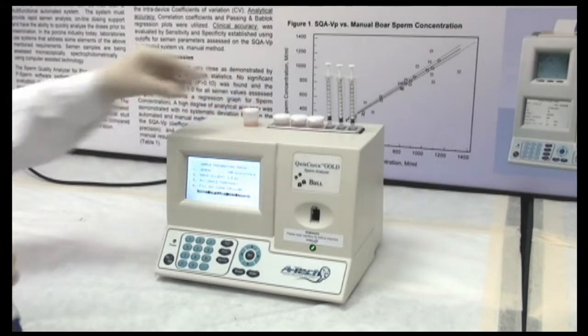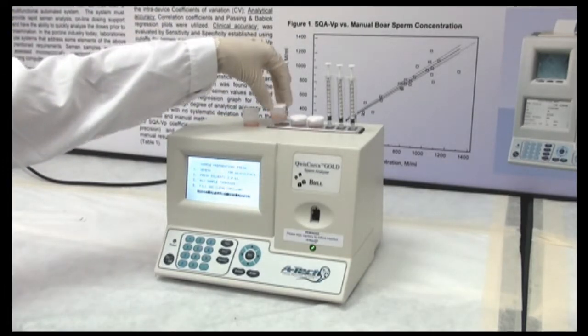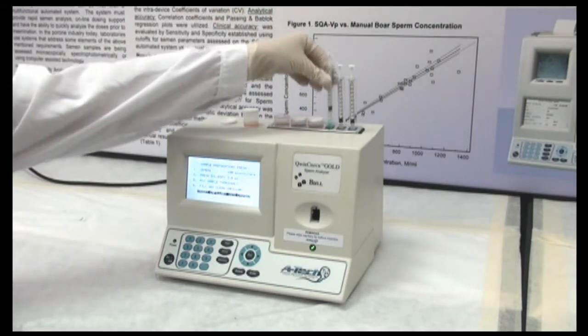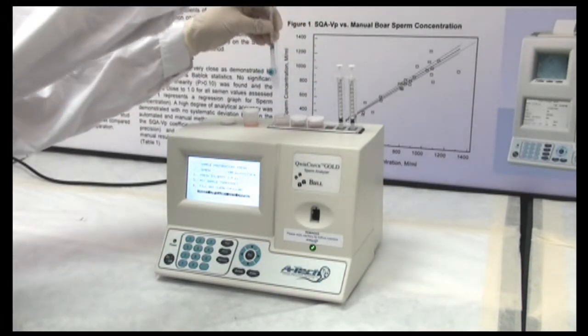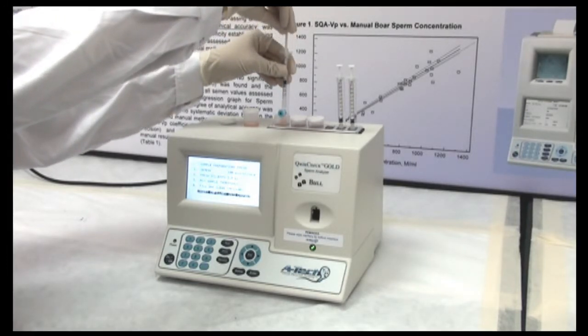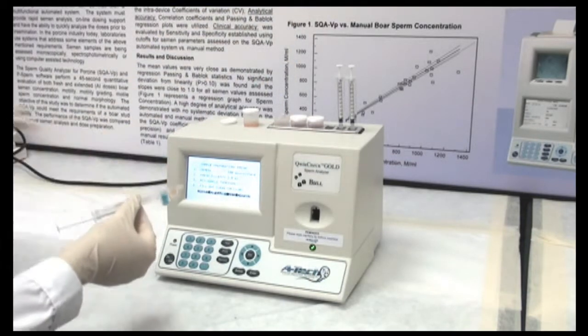Mixing is absolutely essential every step of the way. Mix the raw sample before taking your 100 microliters. Mix the dilution cup after you have added your sample to it, and mix right before aspirating the sample into the capillary. This will ensure the most accurate result possible.